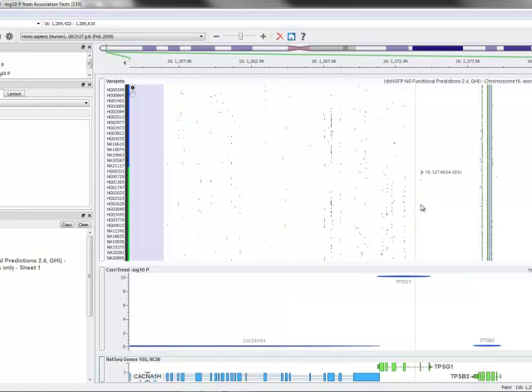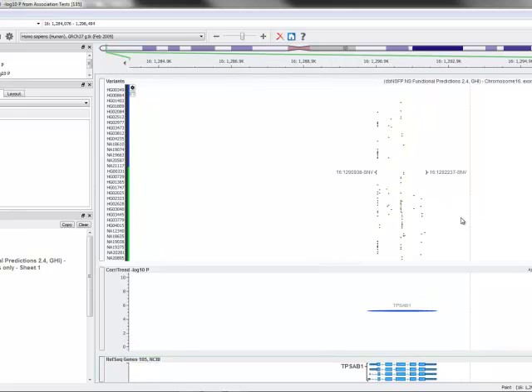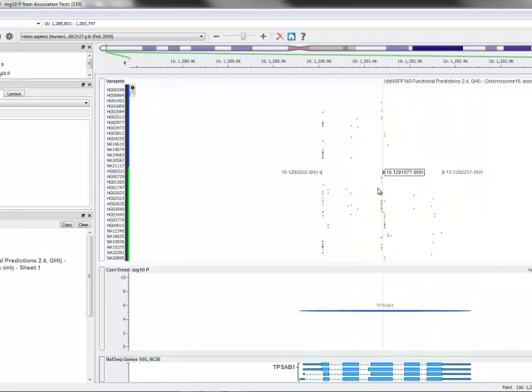And if we look around at some of the other results, we should see similar patterns. So nearby at TPS-AB1, where we have a more moderate association, we see again most of the variation is in the lower part of the image. So with that, we've now set up a very simple, very basic burden test just by cobbling together a handful of features, a few data filters, some summaries, and finally a simple statistic.